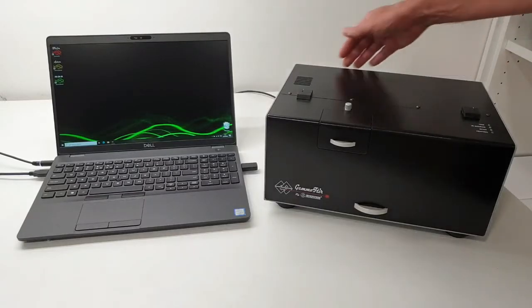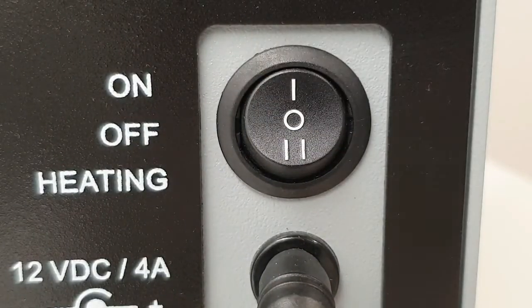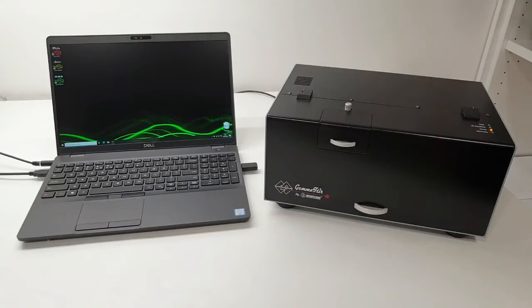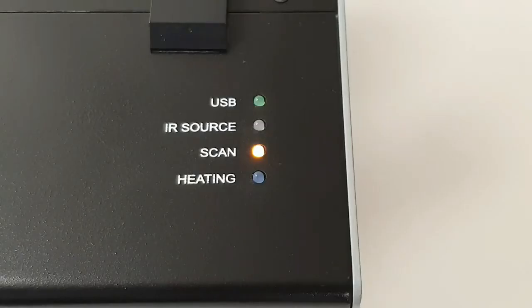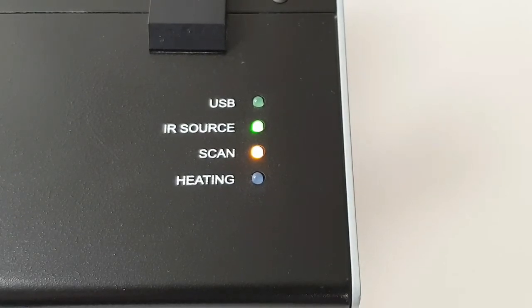Turn on the computer and then press the switch from the back of the unit to the position on. As the unit is recognized by the laptop, 3 of the 4 LEDs on top right side of the spectrometer will turn on. After a few seconds, the scan LED will start blinking regularly. It indicates the interferometer is correctly rocking and ready to scan.